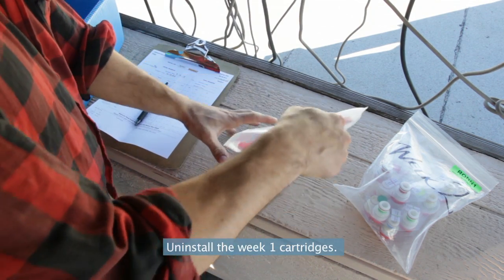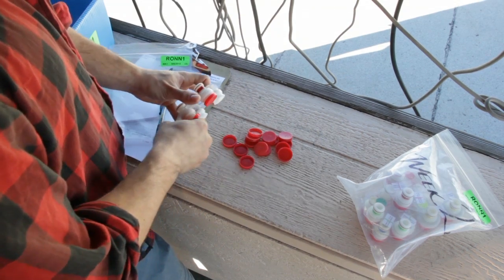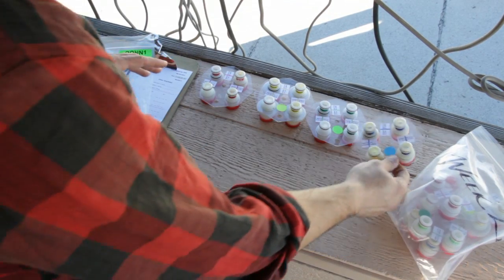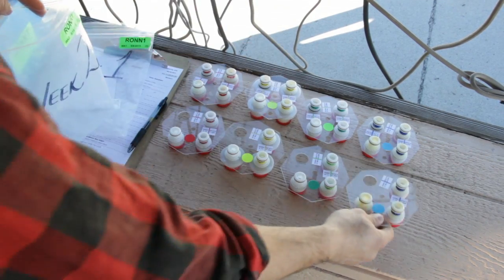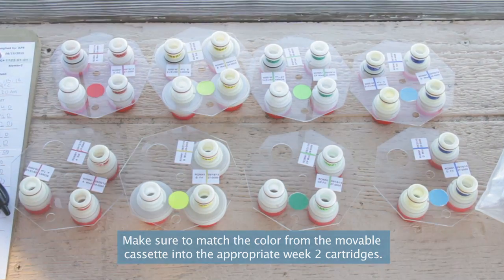Uninstall the week 1 cartridges. The third position cassettes will be transferred to the week 2 cartridges. Make sure to match the color from the movable cassette into the appropriate week 2 cartridges.